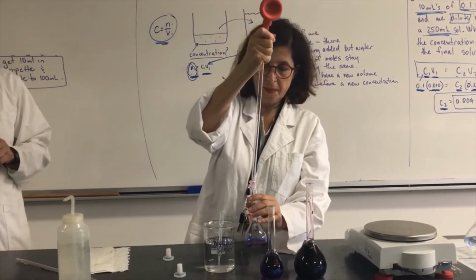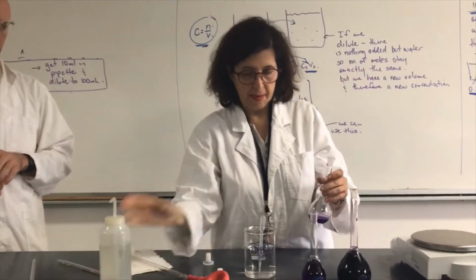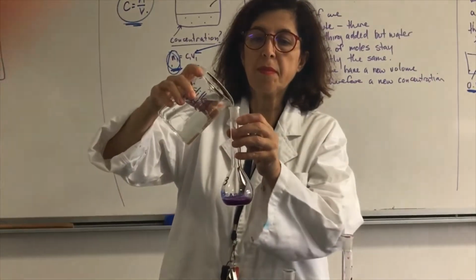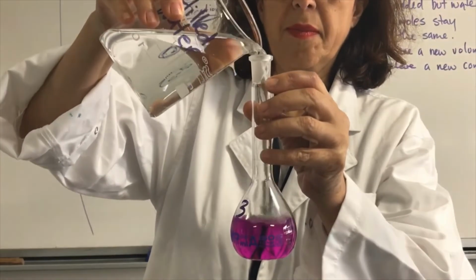So she's demonstrating the correct technique, and if you were doing it in class, this is exactly how you would do it as well. And you can see clearly on this one that it's far lighter than the others.